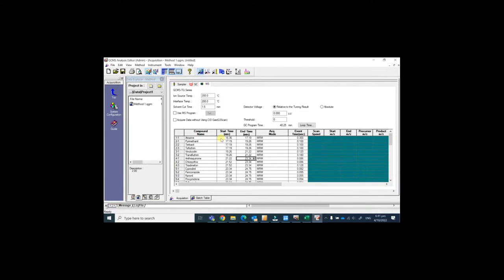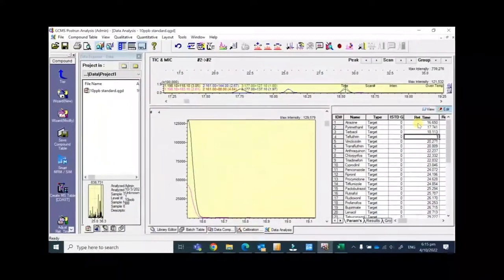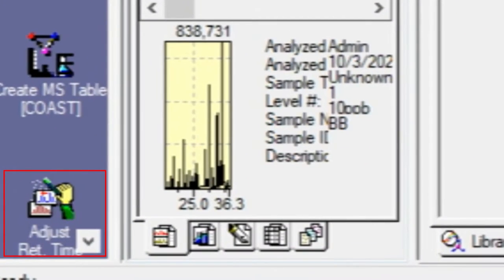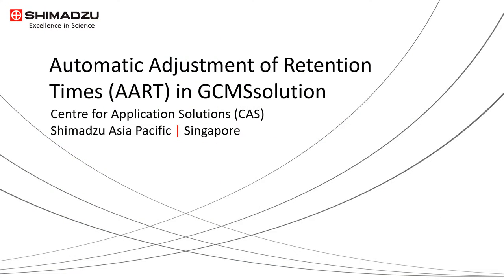Adjusting retention time and MS start and stop time should not be so tedious — let's rewind the clock. With the adjust retention time function in Shimadzu software, modifying retention time can be easy with a few clicks. This video will explain the use of Automatic Adjustment of Retention Times, or AART, in Shimadzu GCMS Solution.